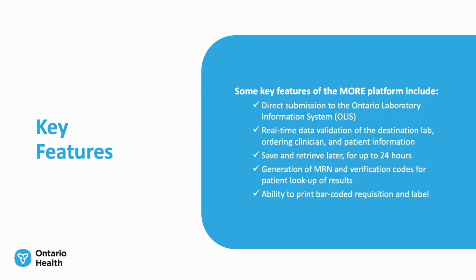This video will also cover some of the key features of the More platform, including direct submission into OLIS, real-time data validation of the destination lab, ordering clinician, and patient information, the save and retrieve later function, the generation of MRN and verification codes for patient lookup of results, and the ability to print a barcoded requisition and label.